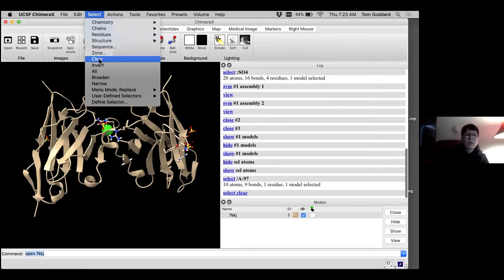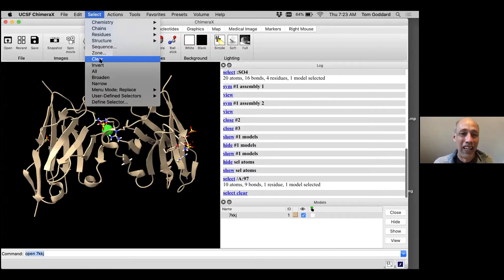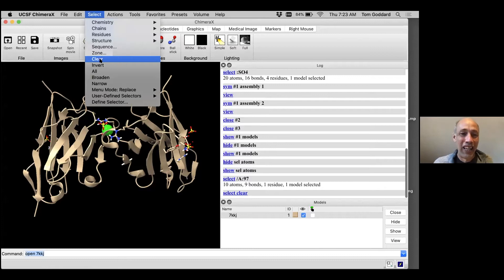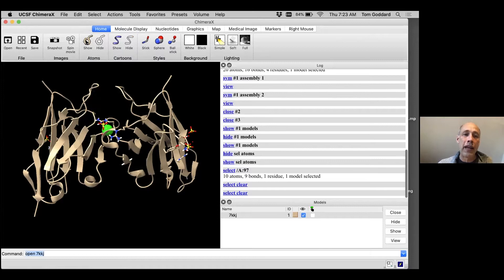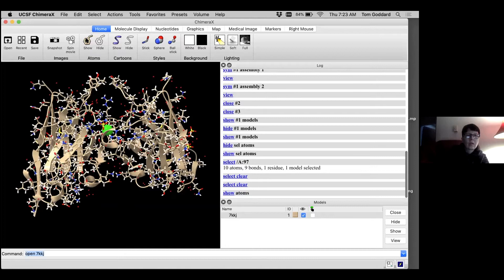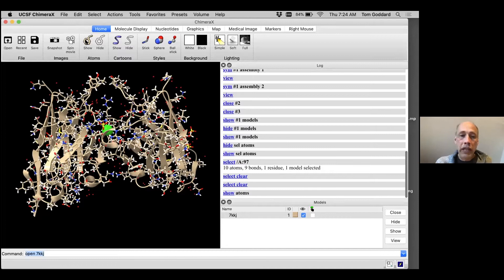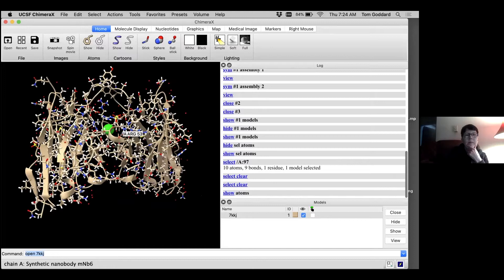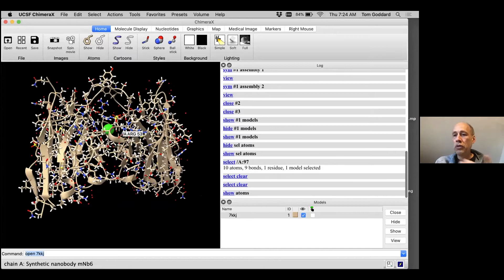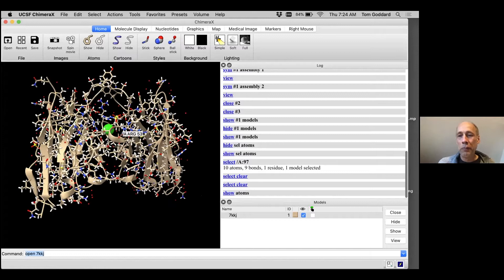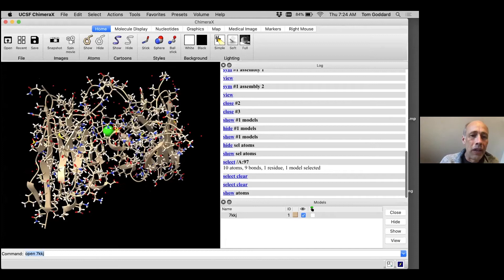Somebody is asking: can you render with the GPU? Yes — all the ChimeraX 3D rendering is done with the GPU. If you have a laptop with just an Intel CPU and no separate GPU, it will use the Intel GPU. If you have a fancier laptop with Intel and a separate NVIDIA GPU, it will use the NVIDIA GPU. We're going to show some fancy lighting in a second that will really heavily use the GPU because it casts a lot of shadows.